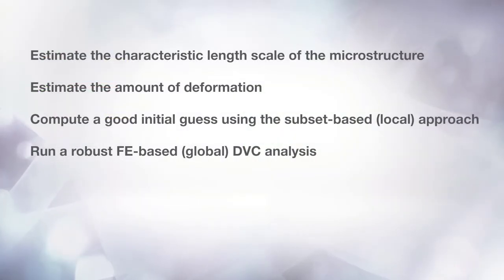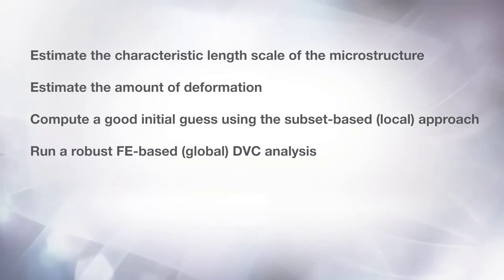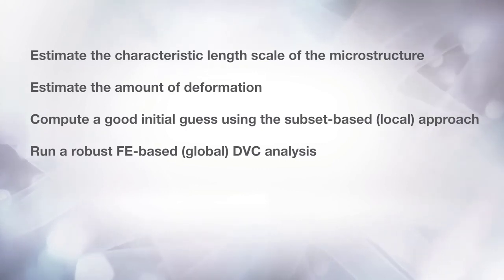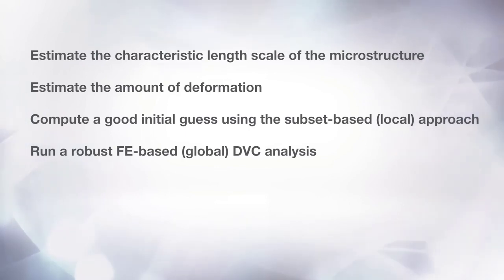As a summary, in this tutorial, you should have learned how to use the new DVC module and optimize its parameters, as well as check for the validity of the results and how to visualize the results of the computation. Goodbye, and thank you for viewing this tutorial.